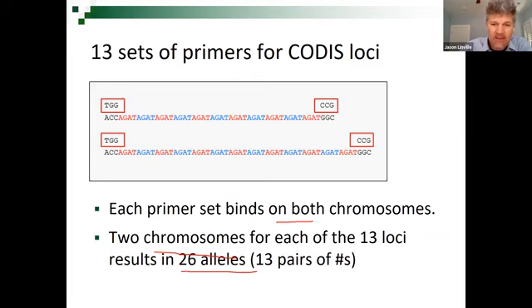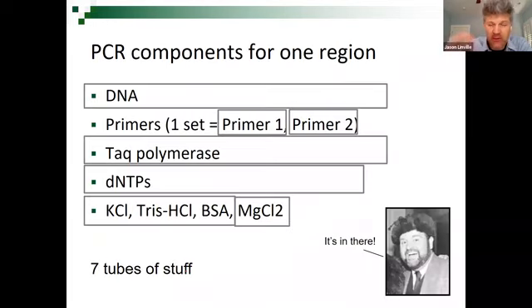All right. And these primers, you order from a company. You basically just order from a company, and you just type in your 15 letters and say, hey, send me a primer, and they send you that primer. It's not just one. It's like millions and millions of copies of that primer in the tube. But then you add water and that becomes your primer.